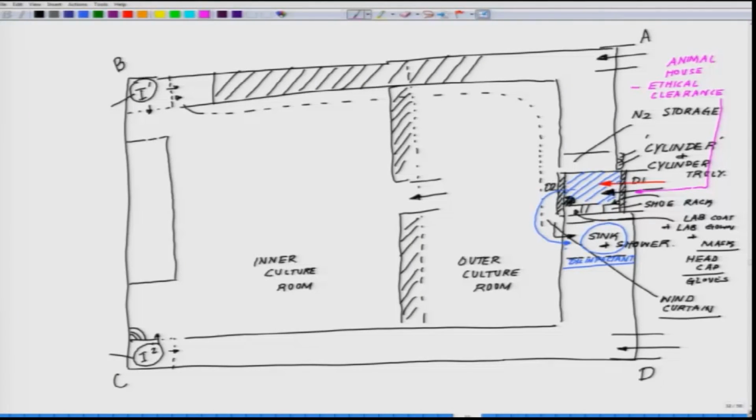So, for example, obviously the animal will not go through all the lab coat or everything; you are just bringing it straight. So, this is the catchphrase. You are getting the animal, you have to dissect it. Knowing this fact, you have decided that the lab is divided in two parts. So, what you can have is you enter here, leave this.